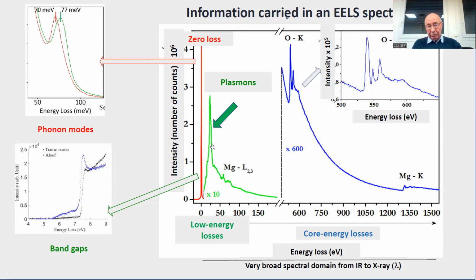In the plasmon loss domain, you also have the intermediate and medium energy loss. You have information about all the electrons of the solid and the answers they give to the interacting primary electron, either individually or collectively. Individually, for instance, you have an energy gap, with no sign of interaction below 6 eV. So this is an energy gap, and then the edge of the band gap there. And very recently now is the advent of phonon spectroscopy. This is typically where you are now with the monochromator.